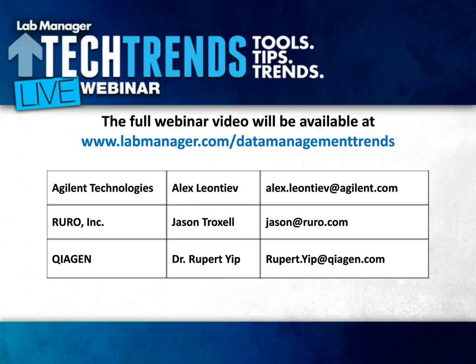Great, thank you. Now, how frequently should a lab be reviewing their informatics solutions? Well, I'll take a crack at that one. Especially from a regulated environment, primarily it's a balancing act. Change is the only constant, right? That's that old and tried cliche, but it's very true. And ultimately, what one needs to do is look at the impact of that change.